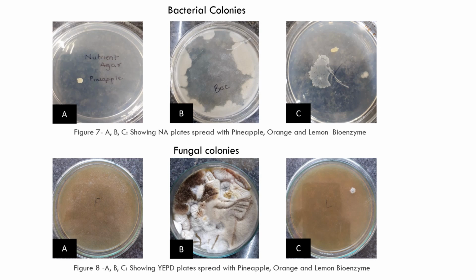Here also 100 microliters of solutions were spread on top of them. The agar plates were kept in incubation for 72 hours at 27 degrees Celsius. Similarly, as in bacterial composition, you can see over here that the orange bioenzyme is showing a lot of microbial fungal growth compared to the pineapple, which has 0 colonies, and lemon, which has only 1 colony.